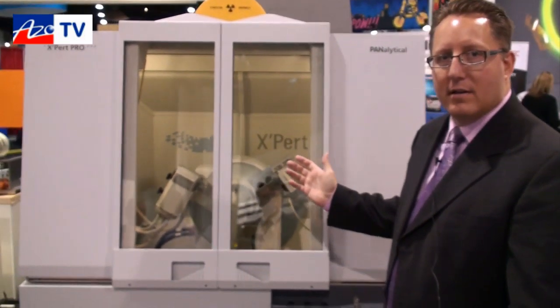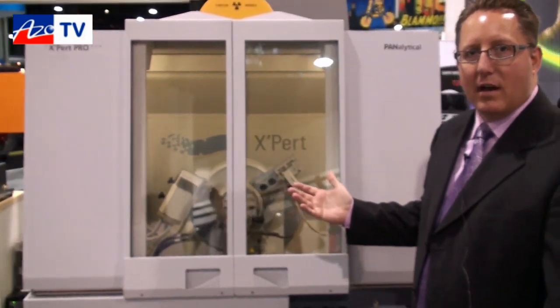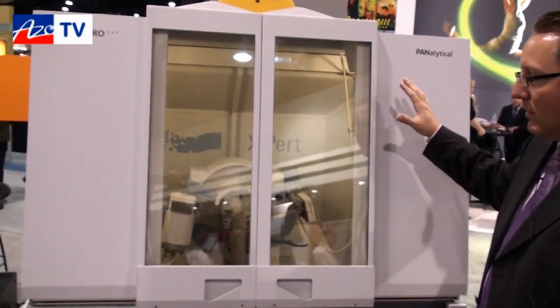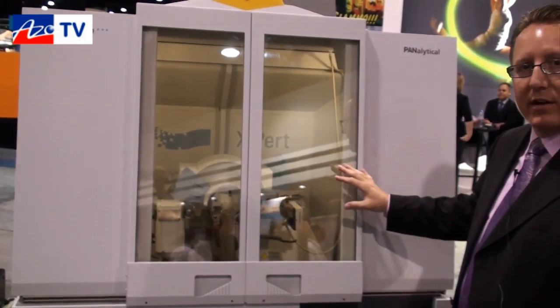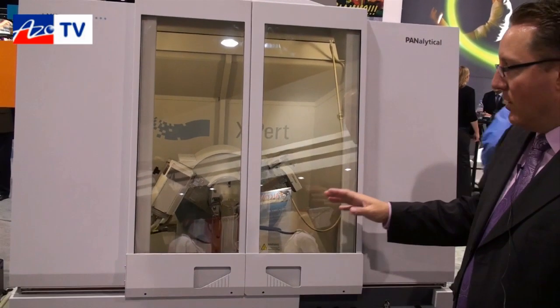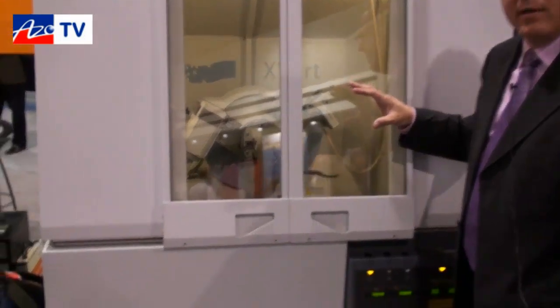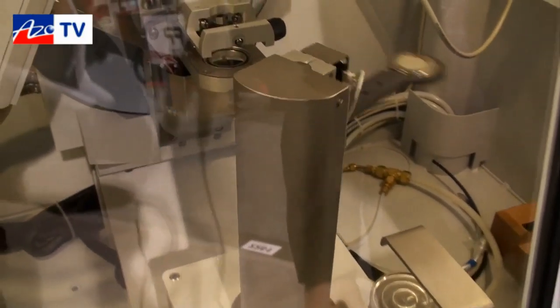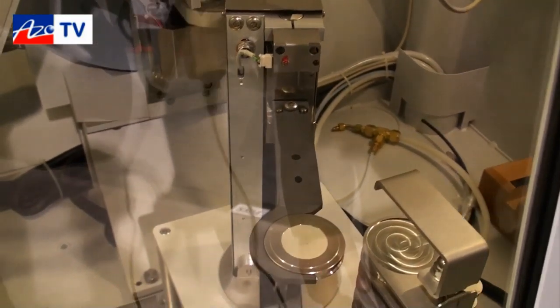Hi Cameron. This is our Expert Powder diffractometer set up to do X-ray diffraction applications on both powders and solid materials. The overall instrument is configured in a Bragg-Brentano geometry with a large 15-position sample changer. If you look inside the instrument, you'll see the system is unloading a sample into our 15-position magazine tray.